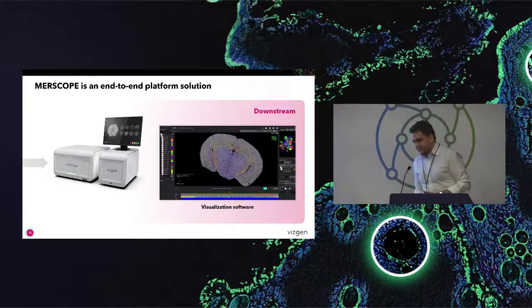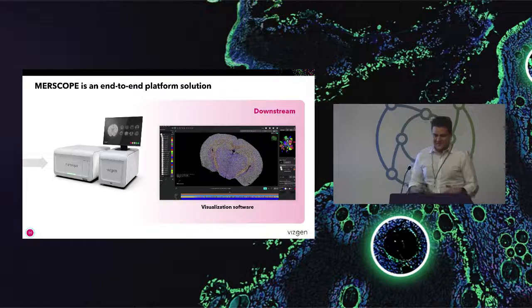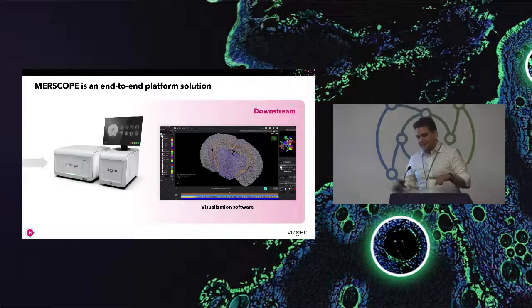Here, for this type of measurement, the biologically useful output is first the primary output of a spatial transcriptomics measurement, which is a list of detected transcripts. In a single measurement at the highest capacity, we can get almost 1 billion transcripts out of a centimeter squared tissue slice in a single measurement. But this just lists out the XYZ coordinates of each detected transcript and the gene identity.